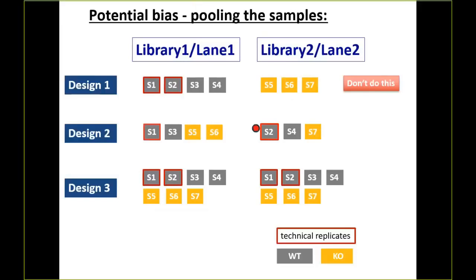But again, here I'd be able to detect it because I'd see some unexplainable and probably unacceptable differences between sample 1 and sample 2, which would tell me that the same sample sequenced differently between two different preps. So that would be basically my proof that something was not reproducible here. Does that kind of make sense now?